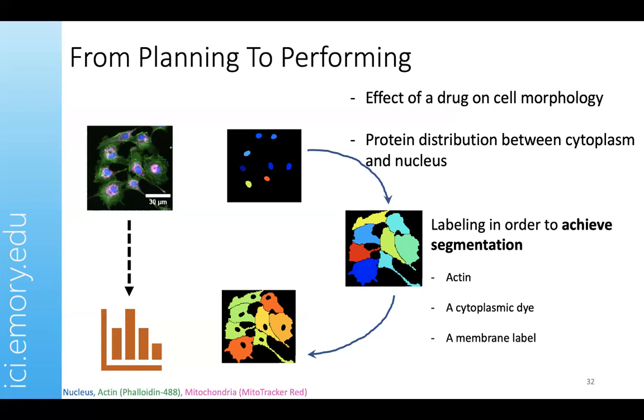An alternate way of still making the lives of these tools easy is if you are using the autofluorescence as a readout. But again, things like autofluorescence and so on can be very dirty. When I say dirty, it means the signal to noise ratio is really terrible, right? So I'm throwing one more technical word here on your head, which is signal to noise ratio. Imaging at the end of the day is about signal to noise ratio, right? So if your signal to noise ratio is really good, everything is very easy, all right?